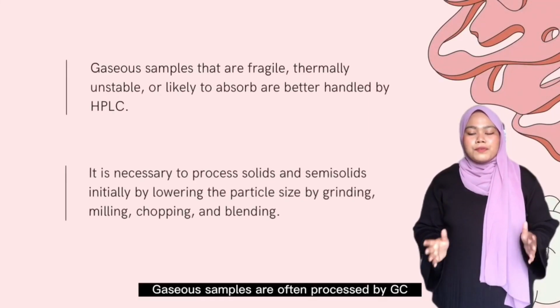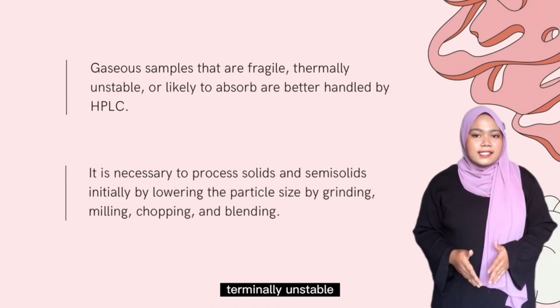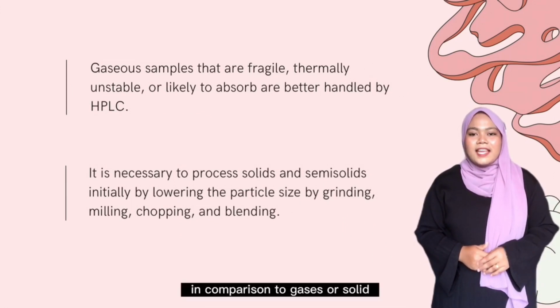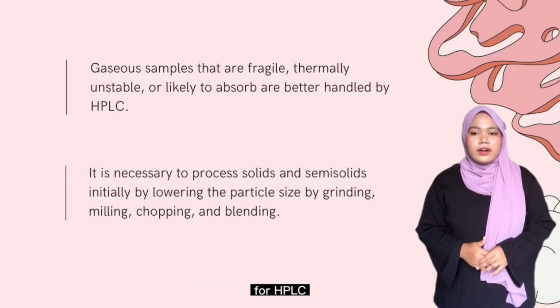Gaseous samples are often processed by GC. However, those that are fragile, thermally unstable, or likely to absorb are better handled by HPLC. In comparison to gases or solids, liquids are simpler to prepare for HPLC.